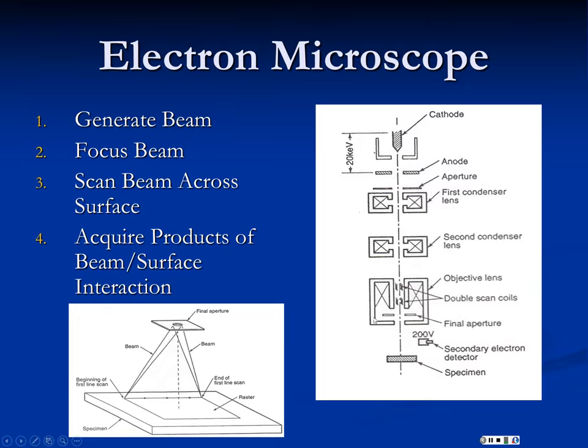You then have one last set of focusing magnets that are your objective lens. The optics here follow a lot of the same rules of optical microscope design. These are really condenser lenses. You have condenser lenses in binoculars, telescopes and microscopes, and a lot of the geometry of the optics works out the same.